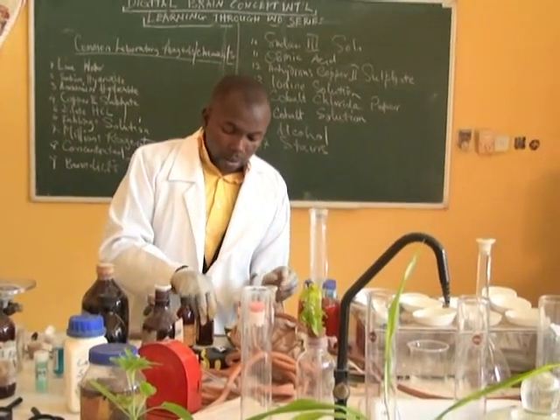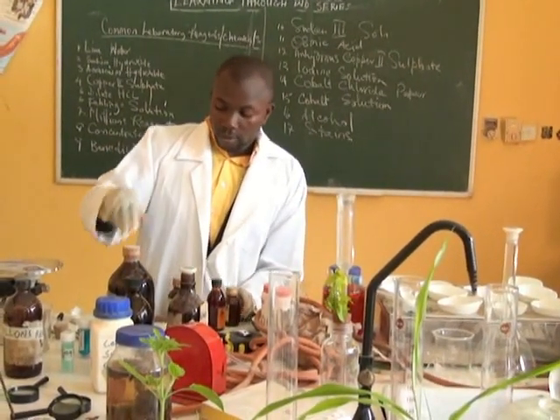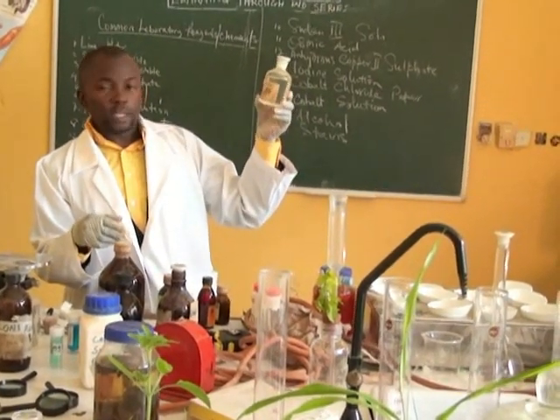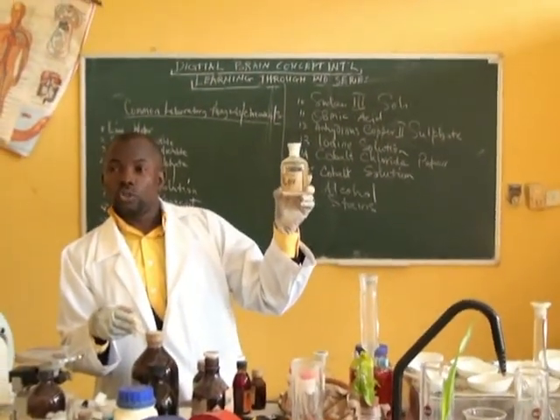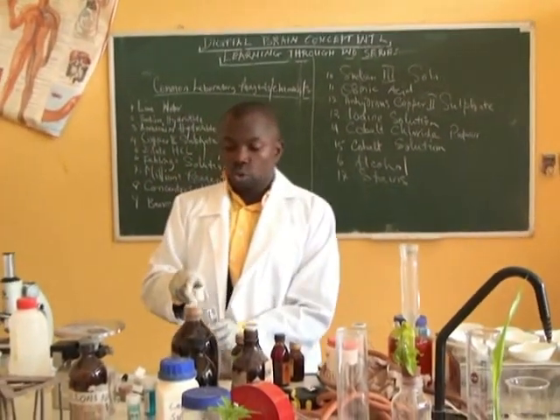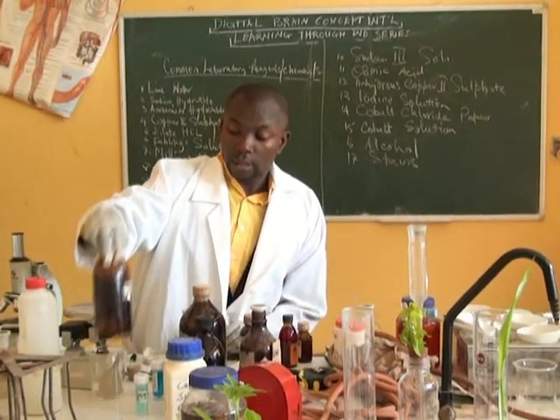Then, we also have sodium hydroxide. We use sodium hydroxide when testing for the presence of protein in biuret tests. So we use it to test for the presence of protein. As we use them, you will see how they are very, very important.